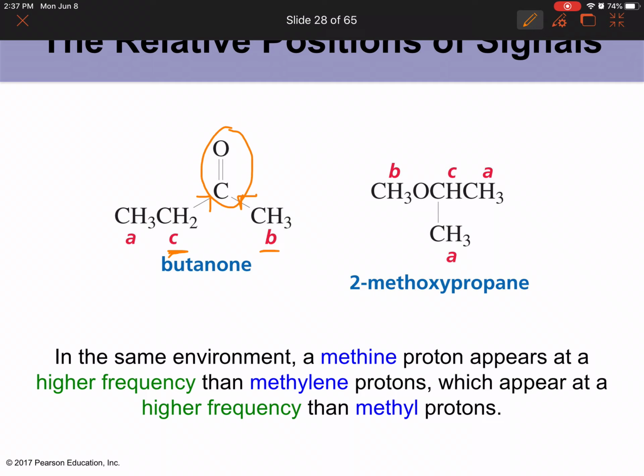Now, if you look at the same concept that we talked about earlier, about the carbon being more electron dense, or carbon would be more electronegative compared to hydrogen. So the B carbon has a carbonyl group and 3 hydrogens, but for the C carbon bearing hydrogens, those 2 hydrogens over here are next to a carbonyl group and also a carbon.